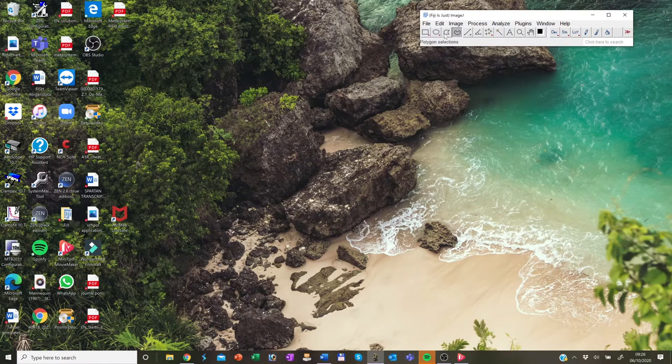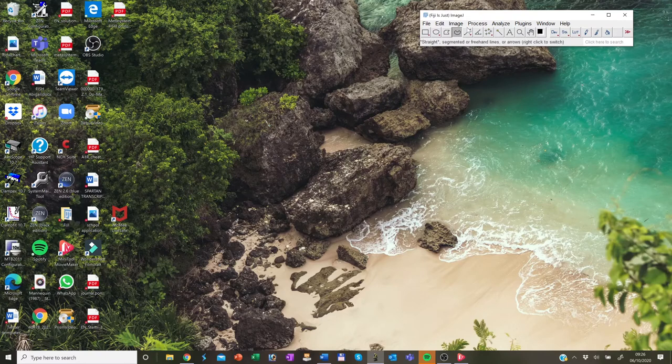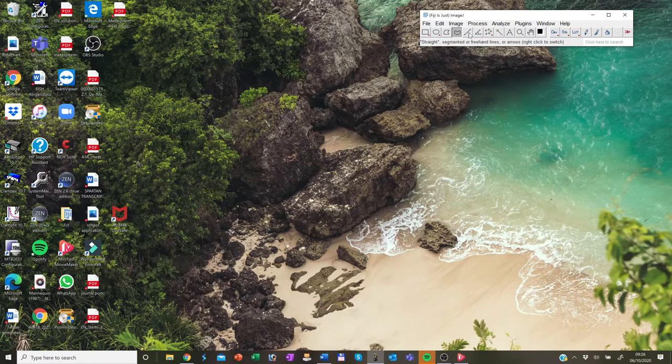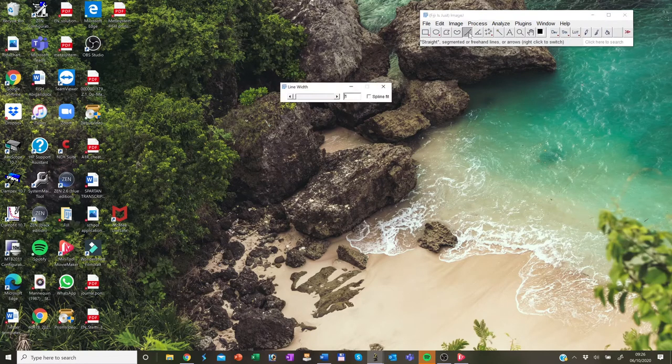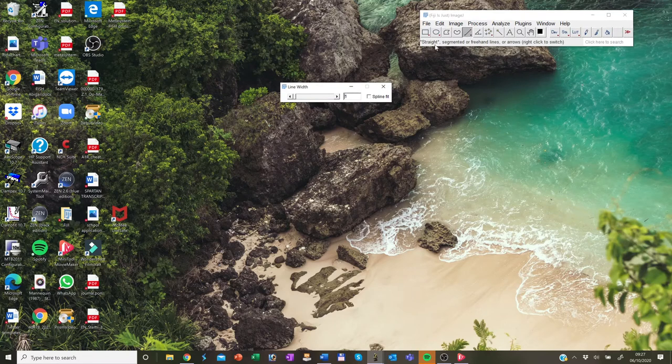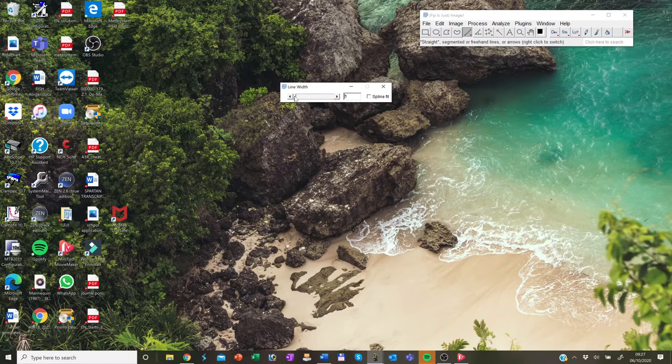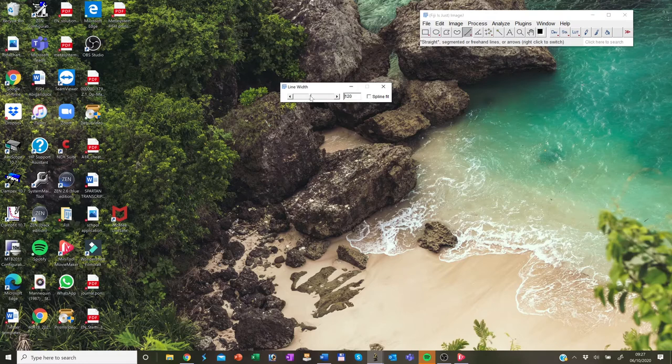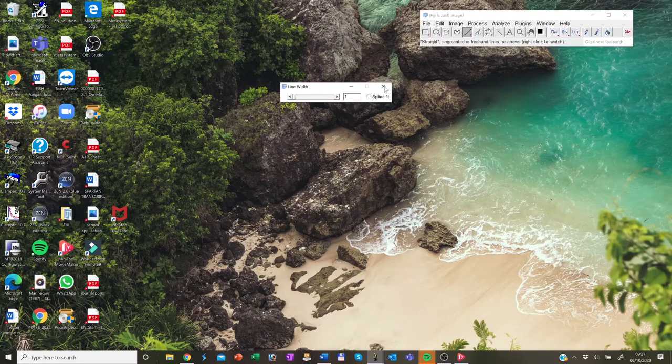Some of the tools also offer option dialogues, which you can open by double clicking on it. For example, here, I double click the straight segment or freehand lines. And I have an option to choose which width the line I would like to work with.